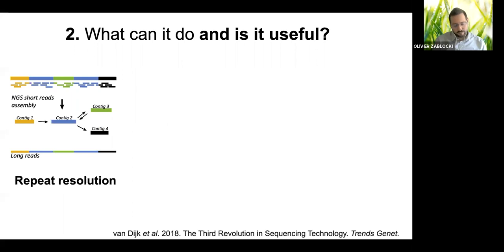At the end of the process, the program is not sure where to place these repeats because there are repeats, so it struggles to determine the continuity in the graph path. If you have a long read, it will obviously cover a longer frame of the DNA molecule, and so even if there are several repeats along a long read, it could offer advantages.